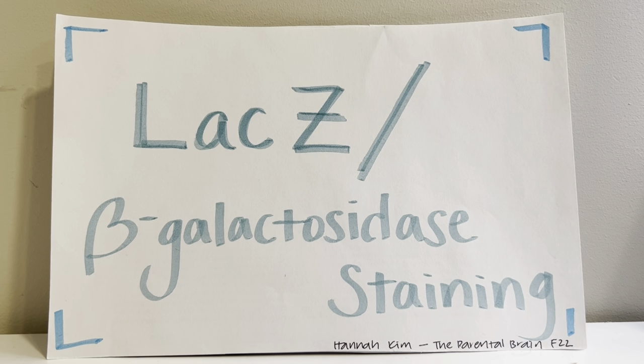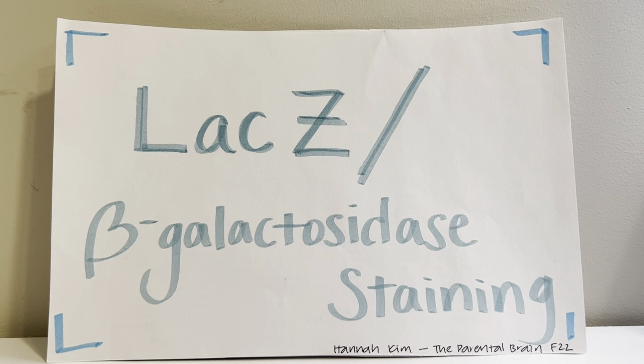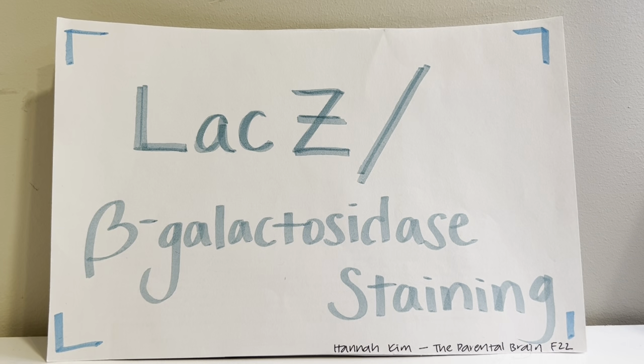Hi everyone! Today we're going to be going over a really important lab technique that's called Lac Z or beta-galactosidase staining.